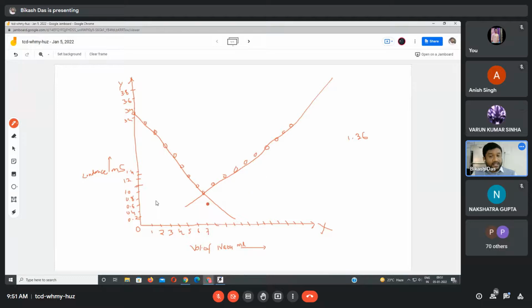Yes sir. लेकिन ये जो graph में जिस तरफ है ना, ये गलत है। मैं जिस तरह draw किया हूं, क्यों गलत है? देखो ये last point में cross हुआ है, तो मैंने बोला ना cross intersection point जो होगा वो होगा हमारा end point, है कि नहीं? Intersection point last point पे है तो graph करने की जरूरत ही नहीं है। तो ये point को मैं थोड़ा change कर देता हूँ, ये ऐसा नहीं आएगा। तो ऐसा नहीं कि तुम्हारा last point compulsory आएगा straight line को, वरना नहीं आ सकता है ना?